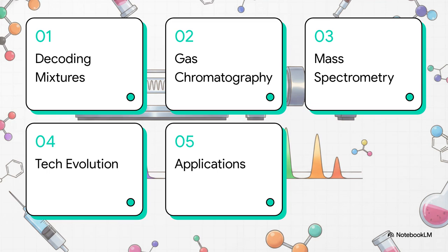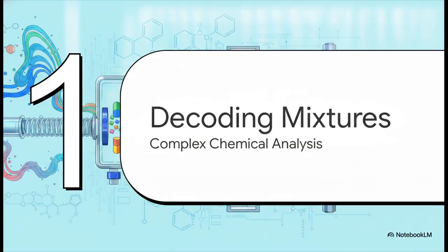Here is our roadmap for today's explainer. We'll start with decoding complex mixtures. Then look at Phase 1, gas chromatography, followed by Phase 2, mass spectrometry. After that, we'll cover the technology's evolution, and finally, real-world applications. Okay, let's jump right in.